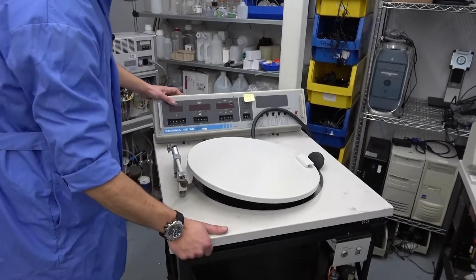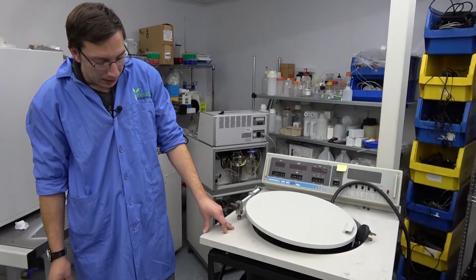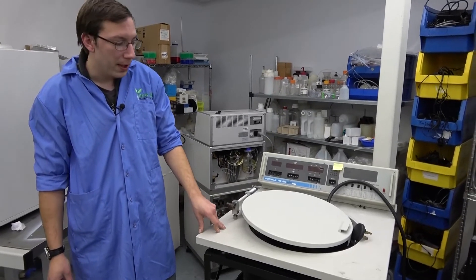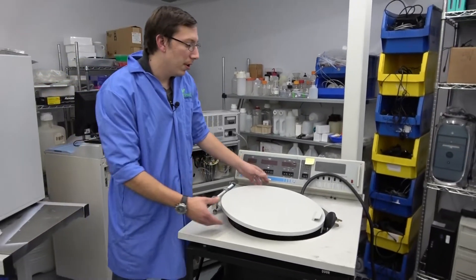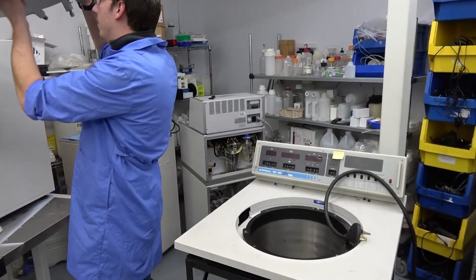And that's most of everything inside of your RC5C Plus. It's very similar for an RC5C, and also similar for an RC5B and 5B Plus, with differences.